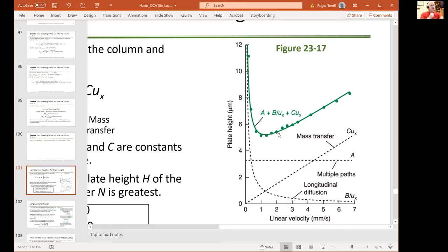We just make the pistons go faster, right? Okay. It's actually a fixed volume pump, and they have pistons that go linearly here, right? But something happens when the flow rate gets too high. What happens, Gianluca? Come on, Gianluca. I have the idea, but I can't put it into words.